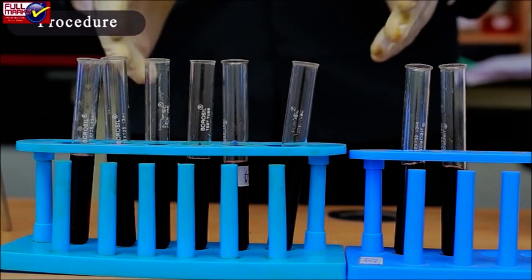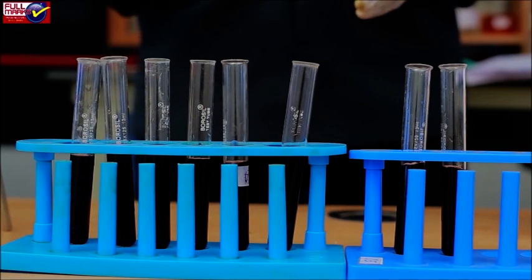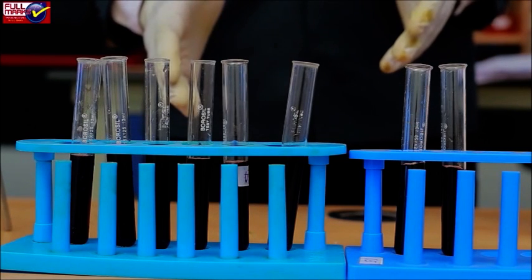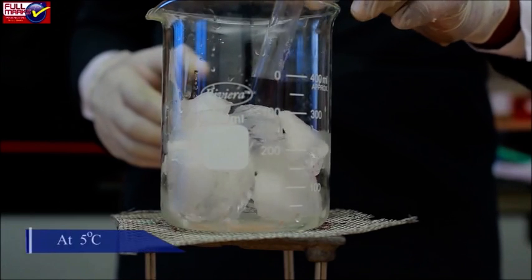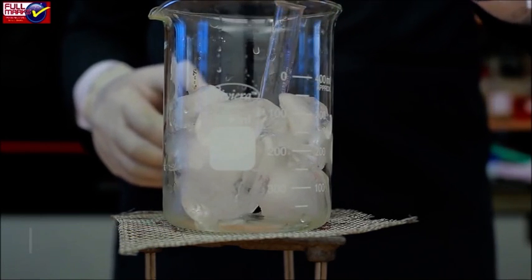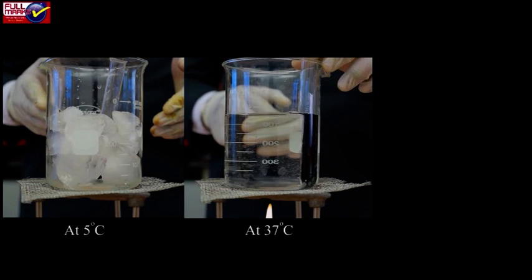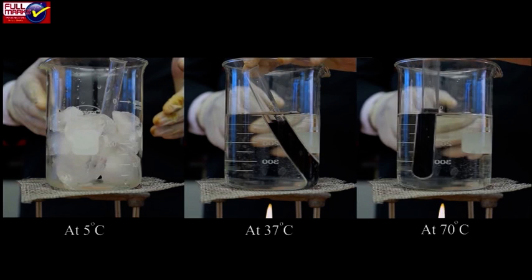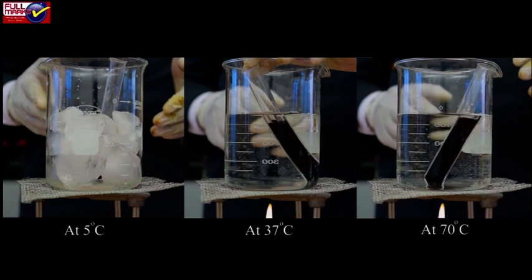Procedure: Prepare 3 sets of iodine tubes with 8 test tubes in each set. Add 1 ml of iodine solution in each test tube in separate stands. Add 5 ml of 1% starch solution and 1 ml of 1% NaCl solution in 3 experimental tubes and maintain them at 3 different temperatures of 5 degrees Celsius plus or minus 2 degrees Celsius, 37 degrees Celsius plus or minus 2 degrees Celsius, and 70 degrees Celsius plus or minus 2 degrees Celsius using separate water baths.